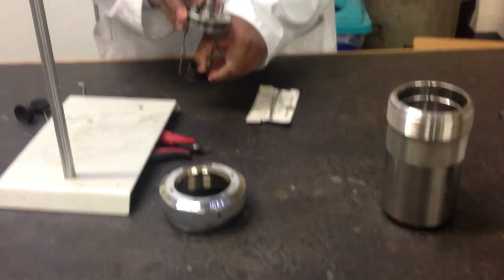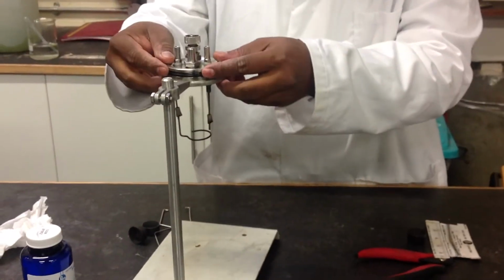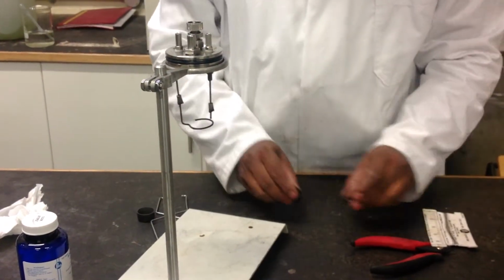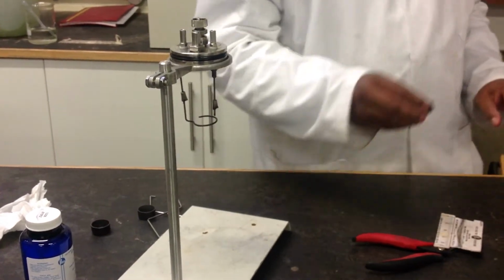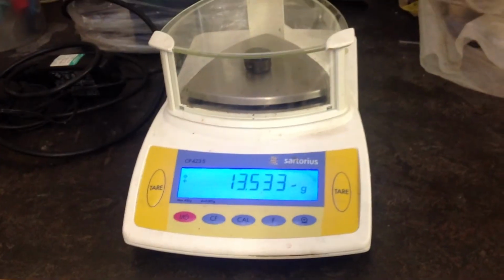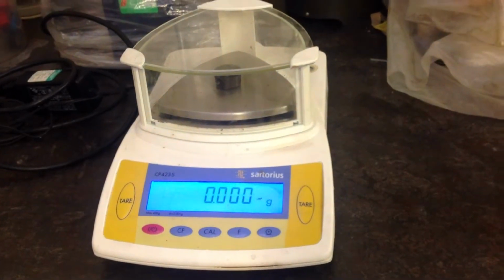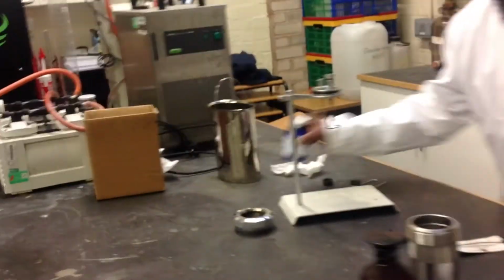What I'll do now is show you the step-by-step procedure. So let's take a crucible here, and then we take this crucible to this precision balance. Put this crucible here, and then tare it so that we can get the net weight of the sample. Take the crucible out from the balance.